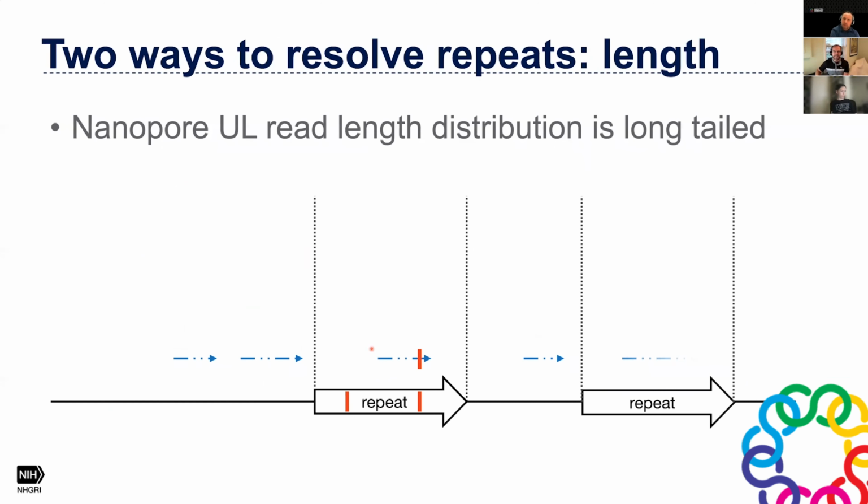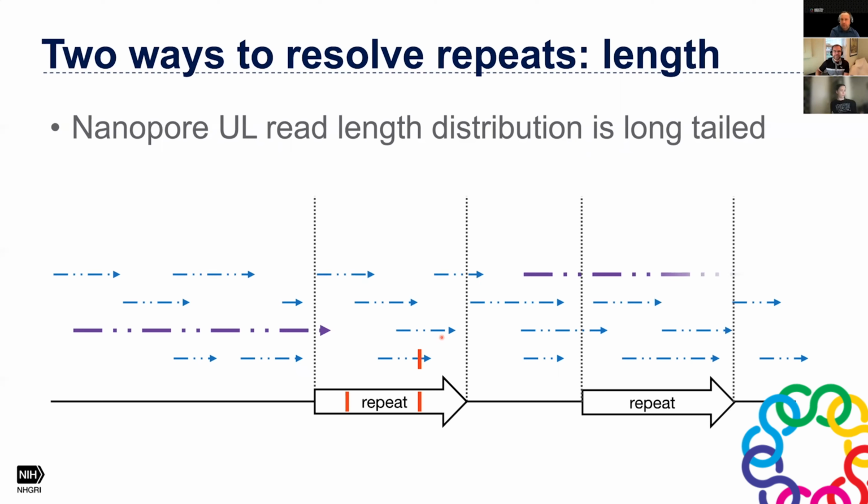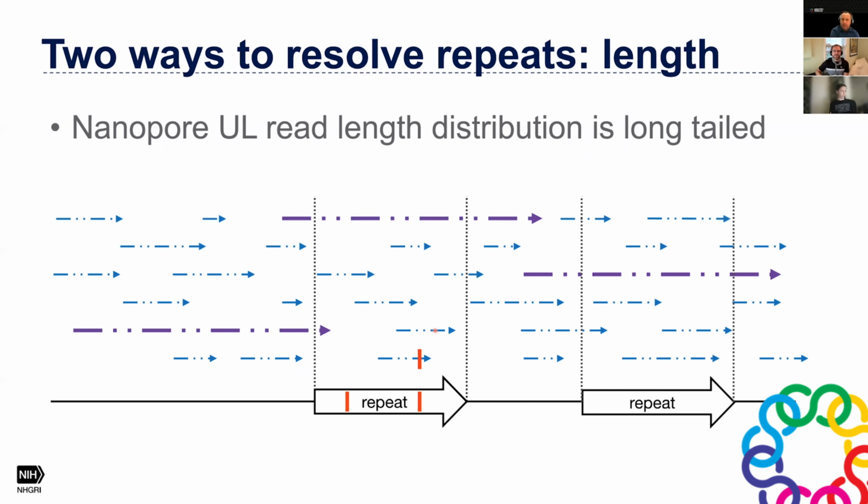If we keep sequencing Nanopore reads, they're very long, but they're very erroneous. So these little gaps here represent errors in the sequencing data. And if we keep sequencing enough, we'll get lucky, and we'll get these purple reads that are long enough that they can be anchored outside of the repeat. So even though none of the reads actually showed us what this little red bit is, we still know that the correct path through the genome is to go through these purple reads. We know we can't connect this purple read to this purple read because of this unique region that the read contains that looks different, right? So this is simple, intuitive. Just because your read is longer than the repeat, you can resolve it.